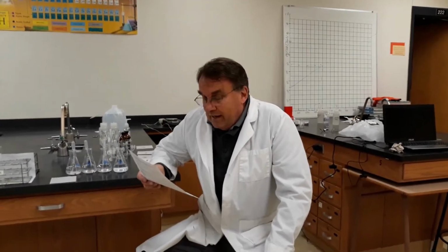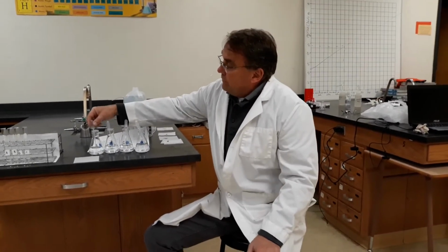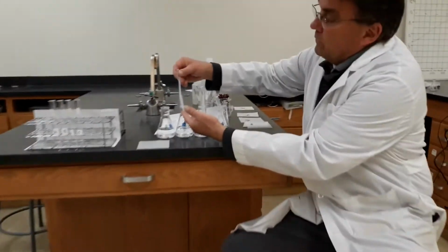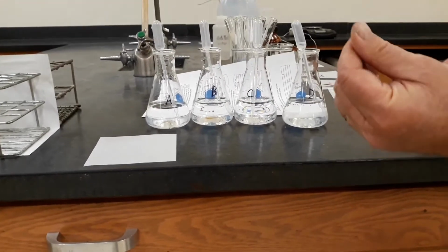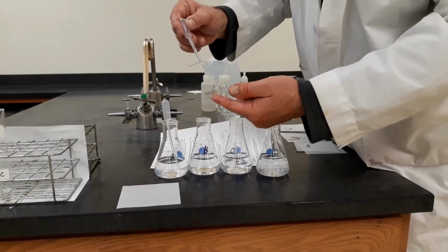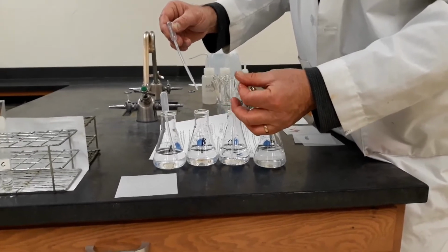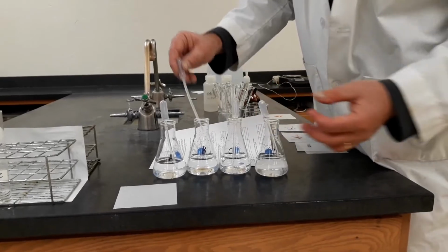So I just recognized that I forgot to do part B, which is the touch test. These substances are known to feel a certain way to the touch. So I just take a small drop and rub it between my fingers, and it is somewhat slimy, slippery. And then rinse in between. Then solution B. Just watery.